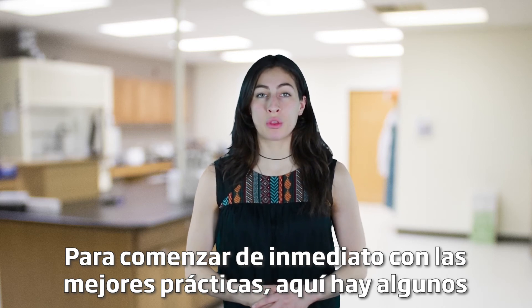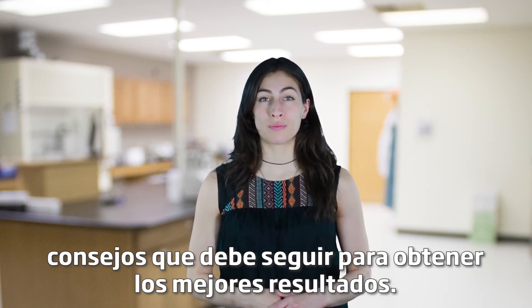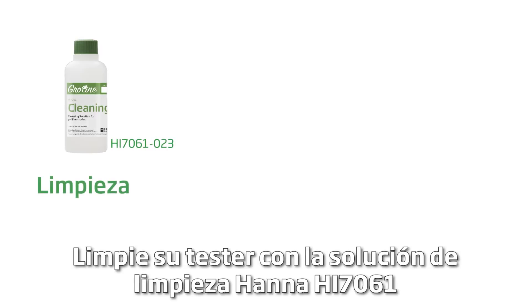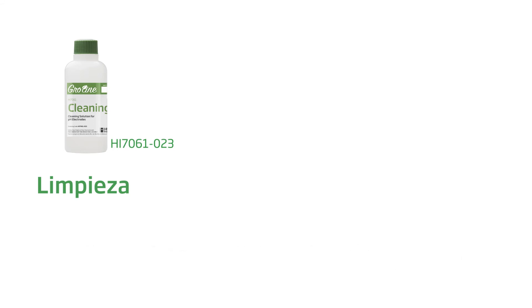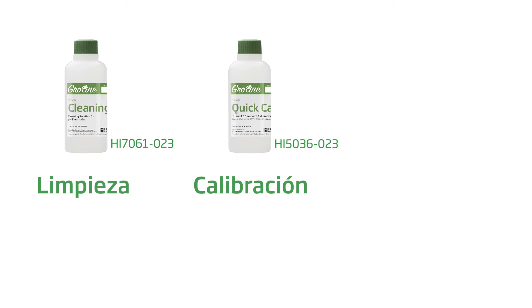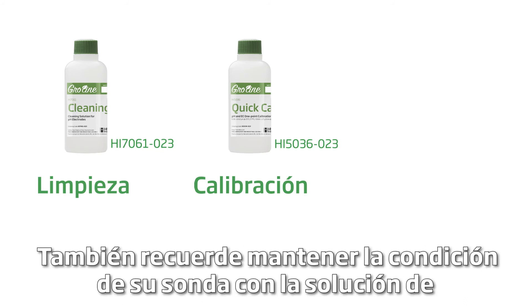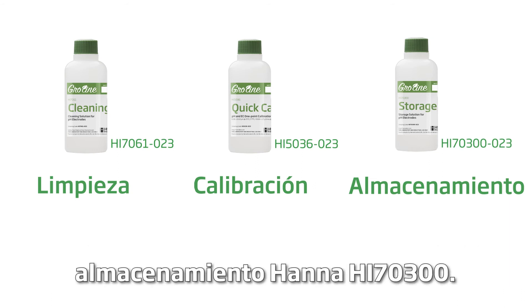To get you started right away with best practices, here are some tips to follow for the best results. Clean your tester with the Hanna HI-7061 Cleaning Solution for 30 minutes at least once a month. Calibrate with Hanna Calibration Buffers before each use. Also, remember to keep your probe conditioned with the Hanna HI-70300 Storage Solution.